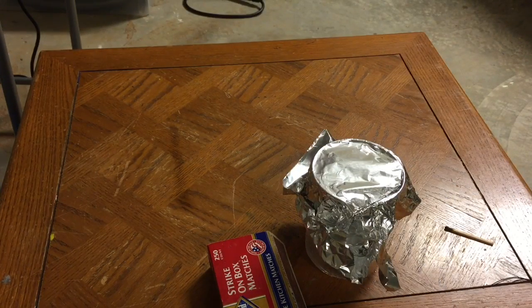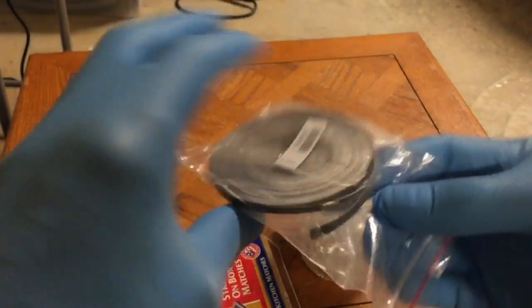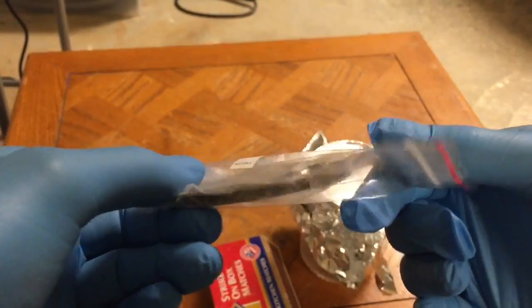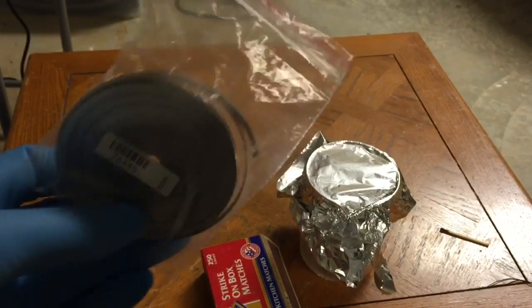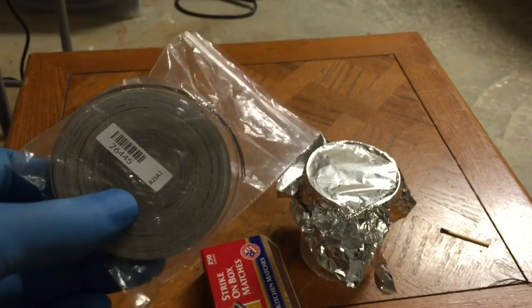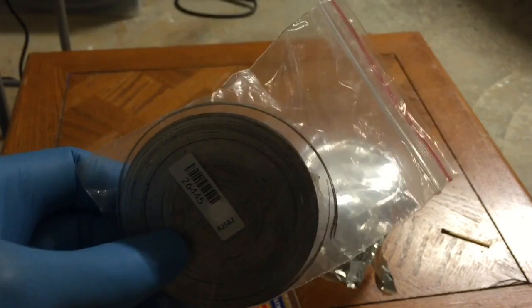Now we're going to do the same thing with magnesium ribbon — that's the magnesium ribbon here that I recently purchased and haven't even opened the bag yet. I'm going to light this with a butane torch and then dip it into the CO2 atmosphere in that beaker to see what happens.